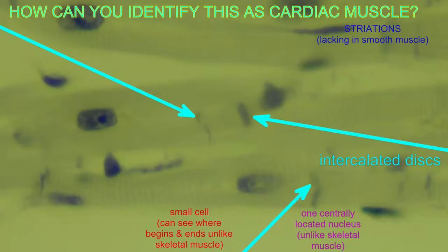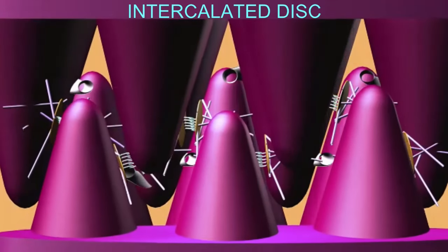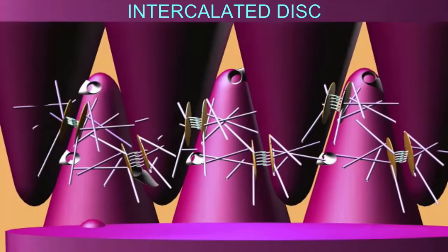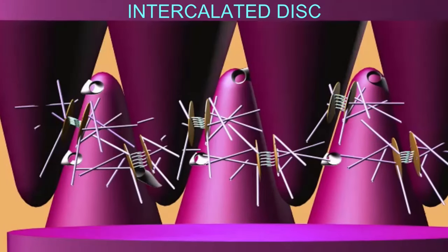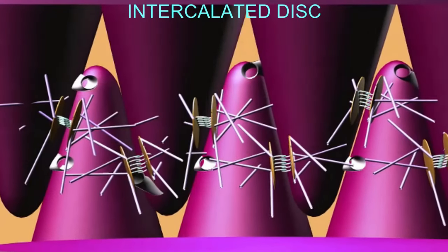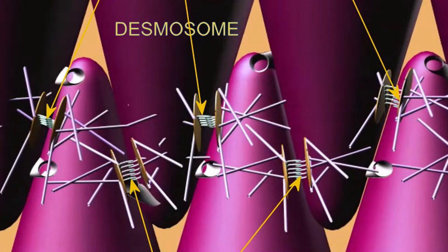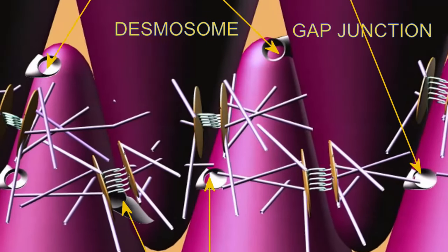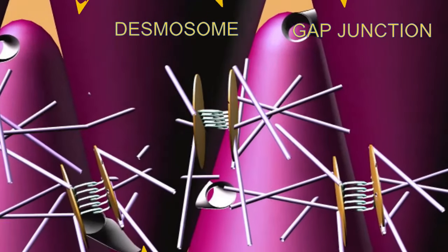Two types of intercellular junctions are found: desmosomes for strength and gap junctions to allow the flow of ions. These intercalated discs are only present in cardiac muscle and are a defining feature in microscopic views of cardiac muscle.